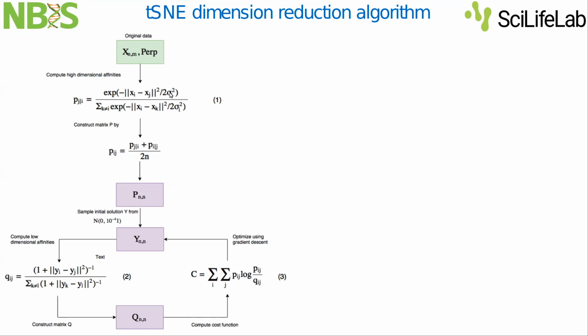It sets how far data points can see each other on this high-dimensional manifold. I said that using t-SNE or UMAP, you're looking only at the nearest neighbors, and this is controlled by the parameter sigma, which sets a screening radius for how far data points can feel each other. This is controlled by this sigma squared parameter.